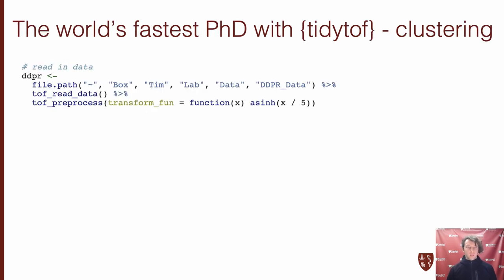So let's start with the first step of their algorithm, which is the clustering part. After downloading the input data files from the journal website, we can pipe our data directory into the TOF read data verb, which is smart enough to read either single files or directories of files in both .fcs and .csv formats and combine them all into a tidy tibble. We can then pipe the result of the TOF read data verb into the TOF preprocess verb, which accepts as an argument any vector-valued function and then applies it to transform all the columns in your dataset that correspond to CyTOF protein measurements.